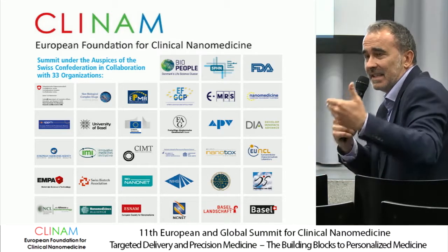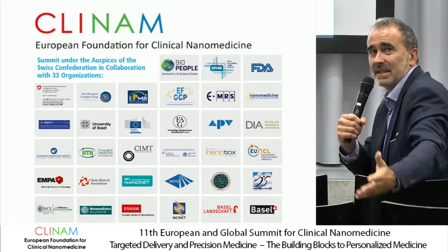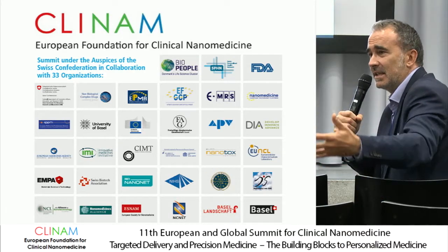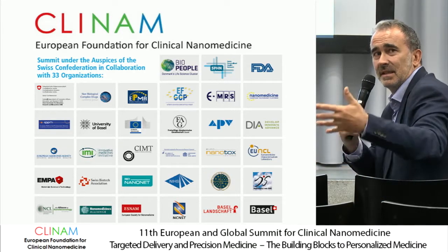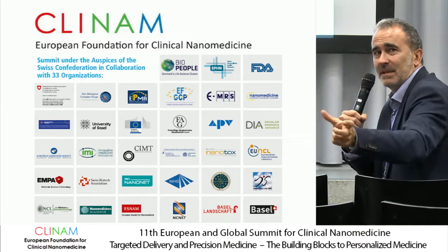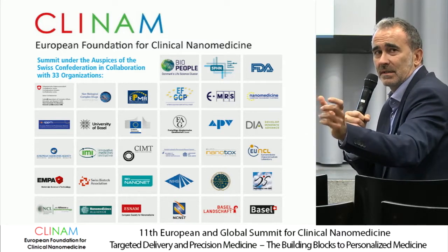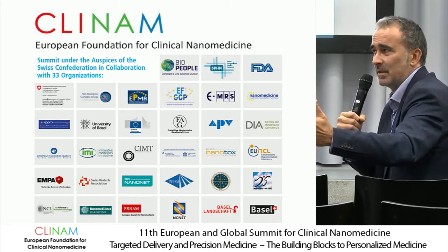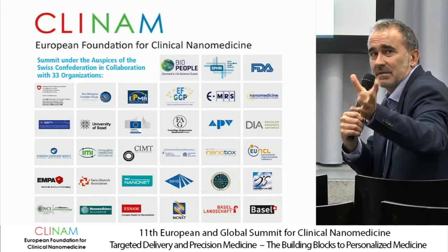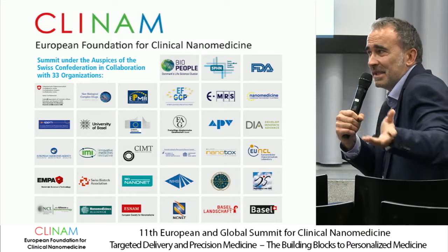And at some point, when it comes to clinical studies, you have to validate your measurement, meaning that you take your samples, add impurities, and identify the optimal dilution range where you get stable results. And this can only be done on the final drug product and not on the in-process samples. I think this is something which is completely different. And this is the pragmatic approach from the industry.